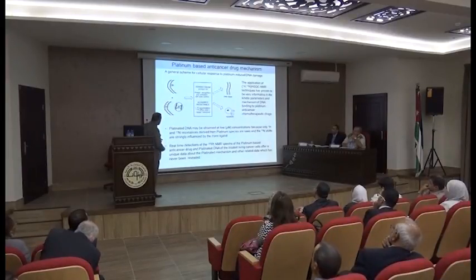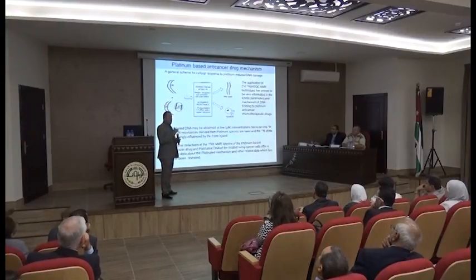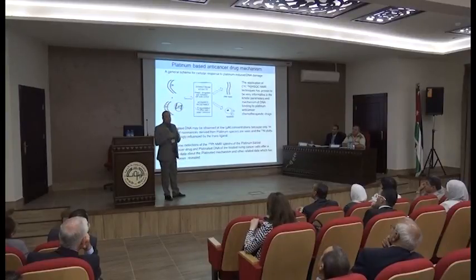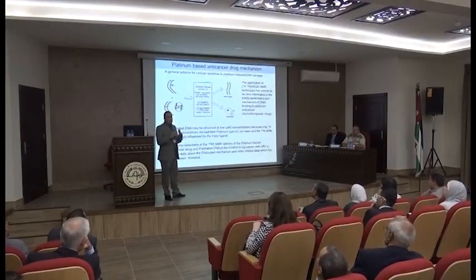So this real-time detection of the platinum is able to give us information about quantity. Where is the platinum? How much inside the cell? How much inside the DNA? And how much outside? In this case, we are able to study the overdoses because at some saturation point, we don't need to exceed this saturation point, and it has no more benefit.